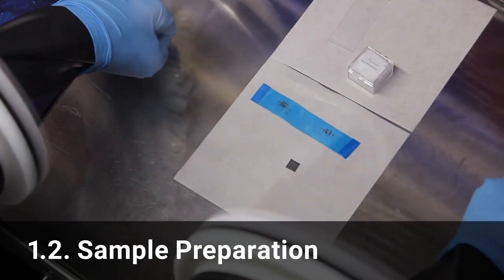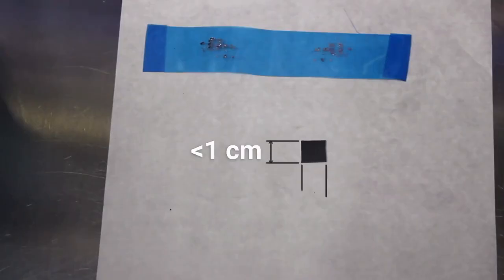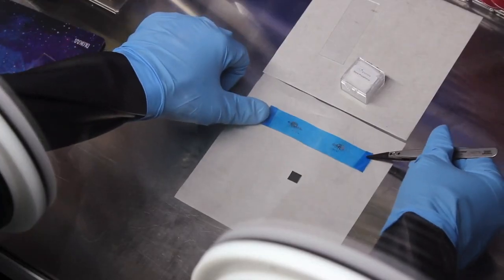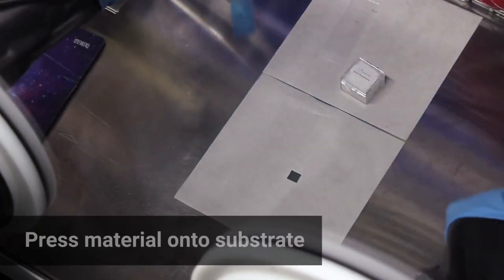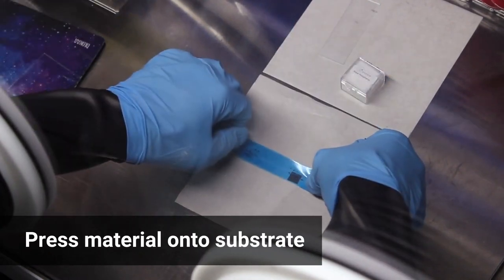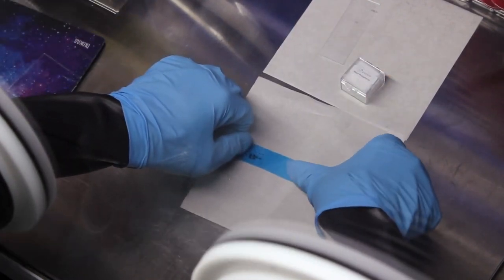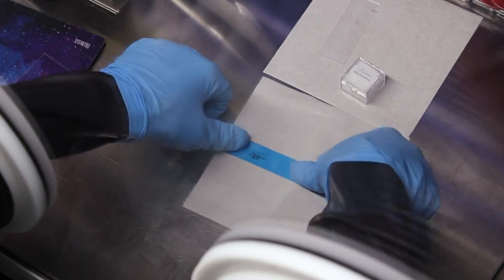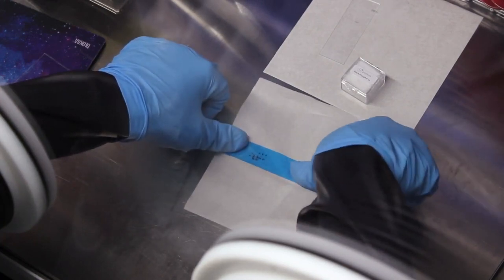Start with a substrate cut into square chips less than 1 cm on a side. Using the prepared tape, firmly press the deposited material onto the substrate. Apply firm pressure with your thumb or gently press with tweezers so the material contacts the chip as much as possible.